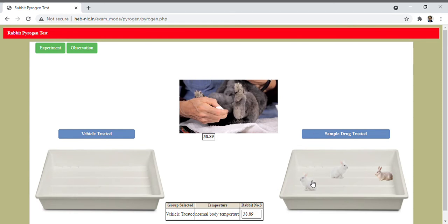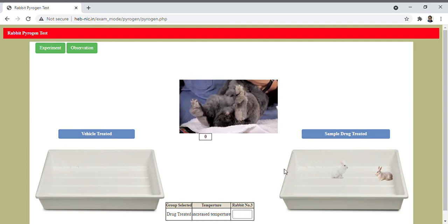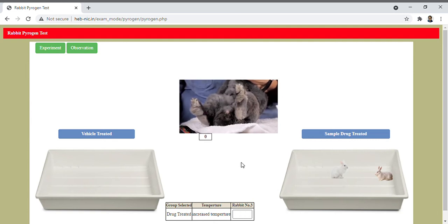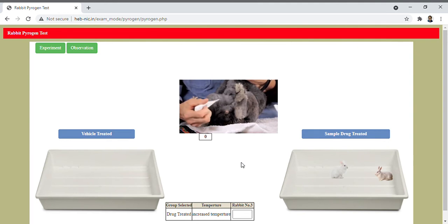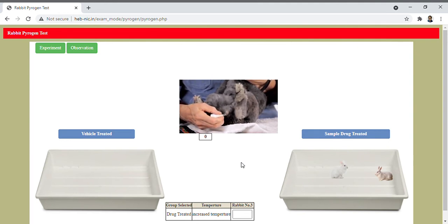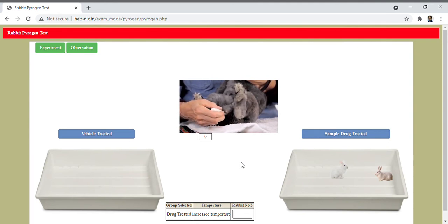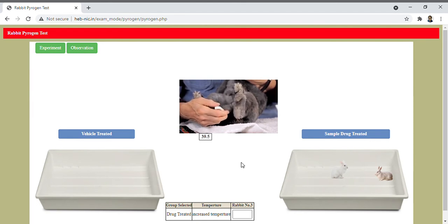Take the first rabbit and record the temperature with the thermometer, and it is 39.5.